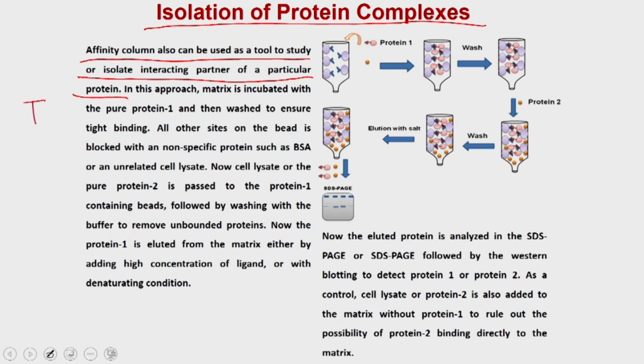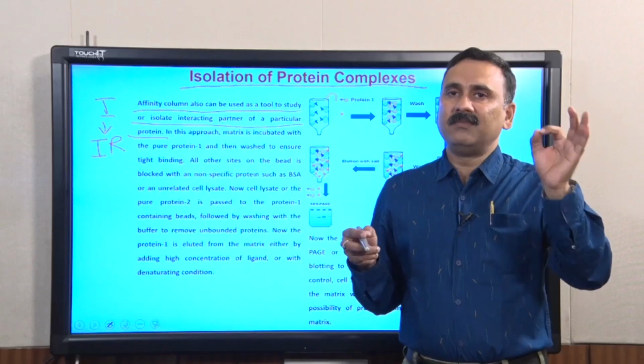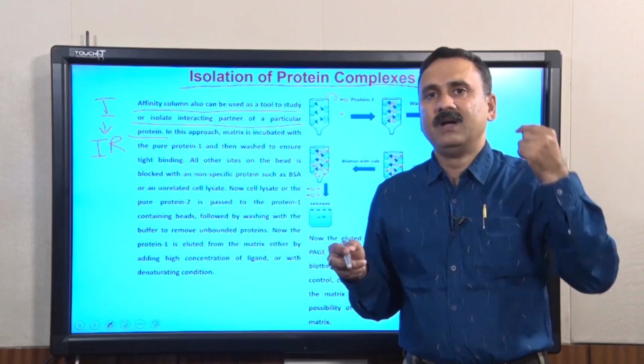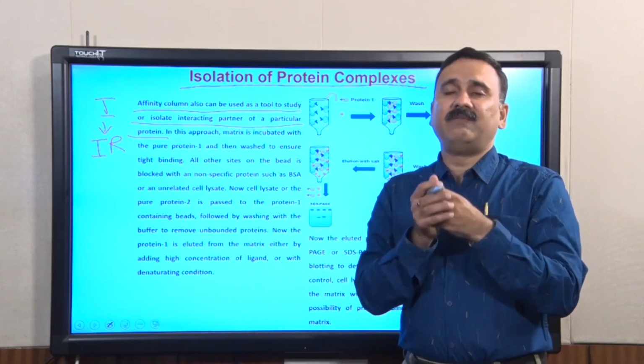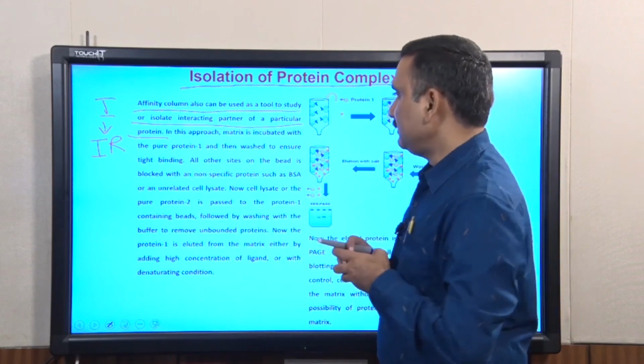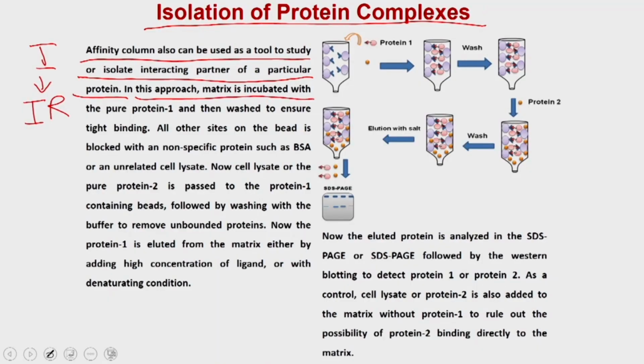In this case, suppose this protein is the insulin receptor, because we are stimulating with insulin. So, our protein number 1 is the insulin receptor. Now, on the insulin receptor, you are going to put some kind of affinity tag. For example, I have put the histidine tag, or the GST tag, so that it has exclusive affinity for the beads. Now, in this approach, the matrix is incubated with protein number 1, the insulin receptor, and then you wash to ensure tight binding, which means the beads have the insulin receptor present on their surface.